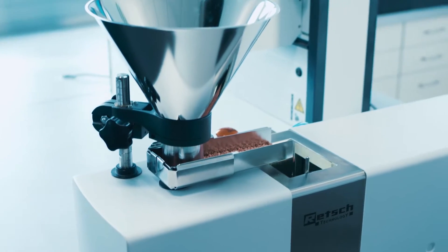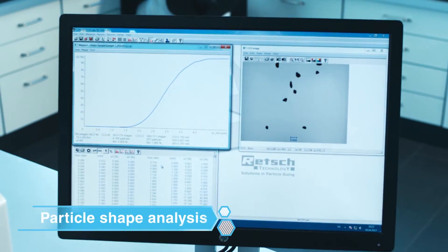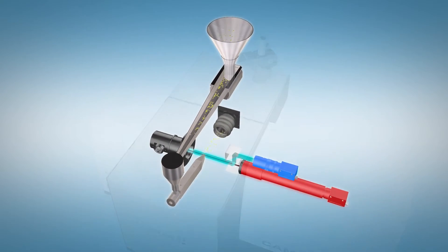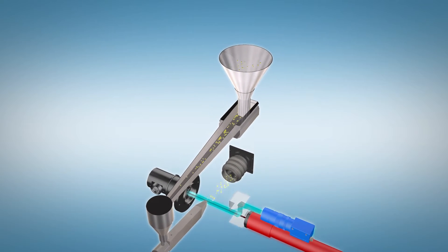The analyzers of our CamSizer series operate on the basis of dynamic image analysis. Thanks to the patented two-camera principle, they cover extremely wide dynamic measuring ranges.